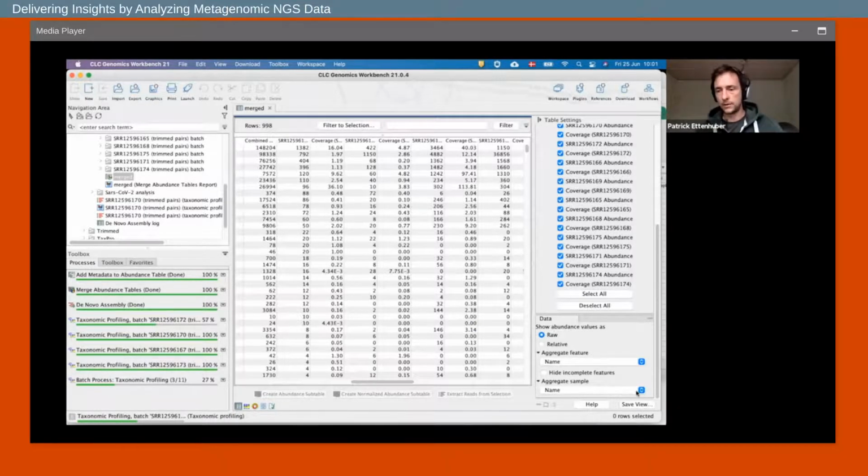And it's rather simple to see that now there is additional metadata in here that is written in non-capital letters, and that's the one that's coming from the external spreadsheet.